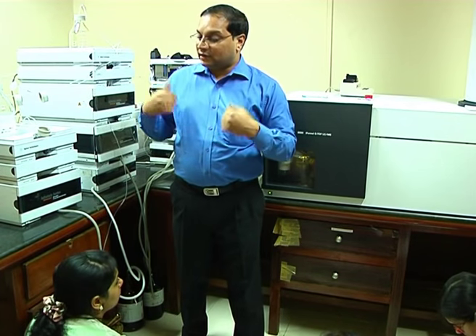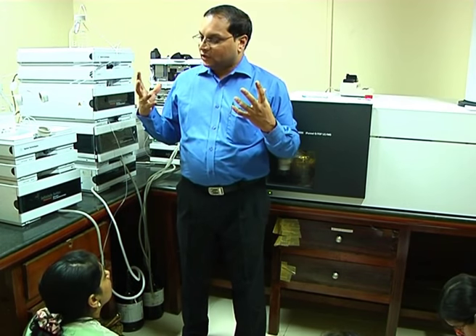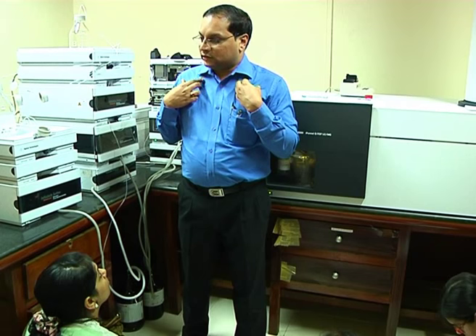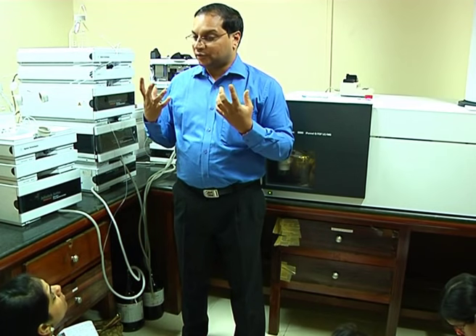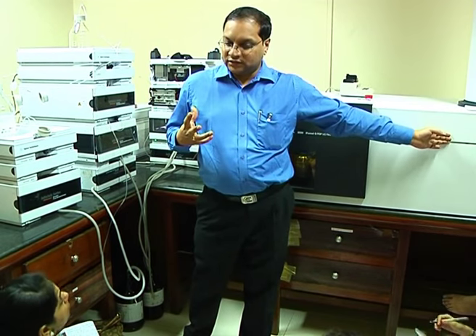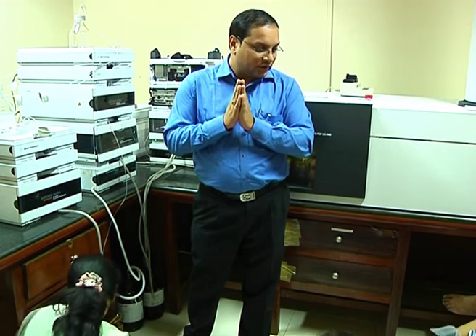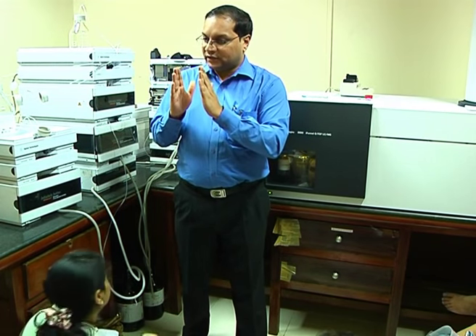For our case, in an unknown scenario, we know that there are different types of protein, and I don't know about that protein. So in the first place, I want to establish the identity of that protein. So I need accurate mass information. I cannot use a triple quadrupole type of device, which has unit mass resolution. It cannot see beyond 1 Dalton difference.